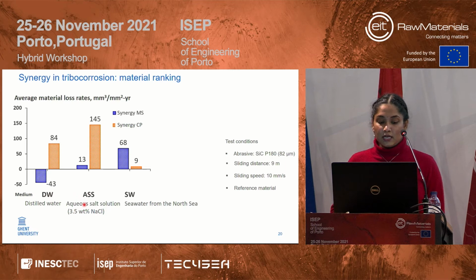The second one is an aqueous salt solution of 3.5 weight percentage NaCl. Why do we do this? Because we want to keep the electrochemical interaction controlled using a single salt. And here we do the tests from the water in the North Sea.